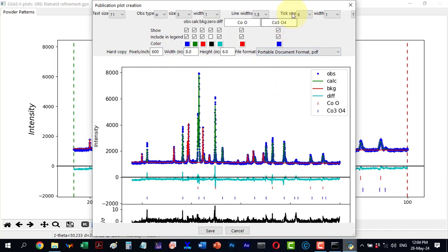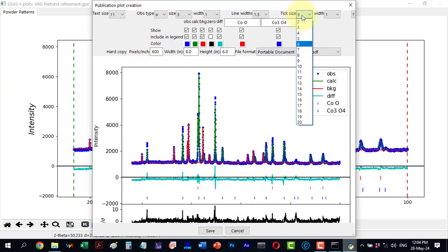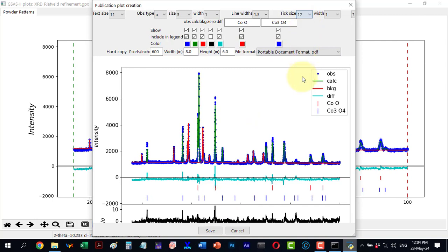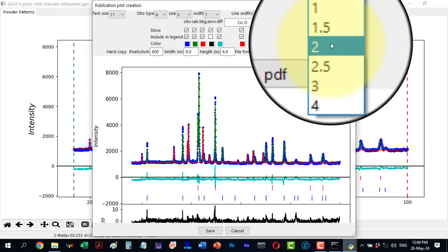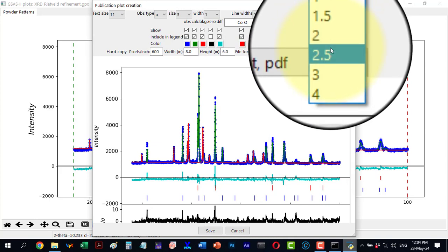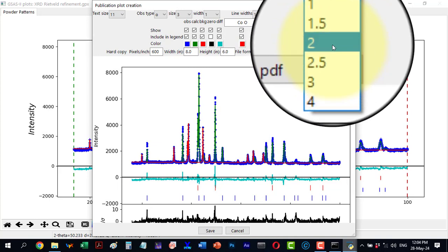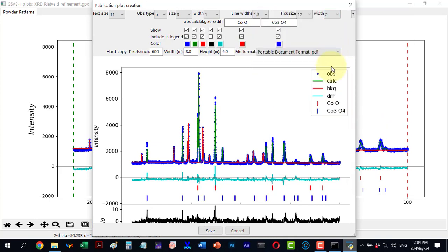For tick size, the default value is 6. I can increase it to 12 and the tick size updates. Similarly I can change the width from 1 to 2 and it updates accordingly.